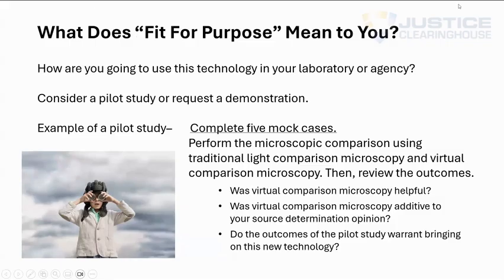So one of the things that I strongly suggest is doing a pilot study, figuring out what fit for purpose means to you. One example of a type of pilot study is to have, say, 5 mock cases, complete them with the light microscope, traditionally like you have done in the past, and then also using a VCM technology and comparing those two, or looking at that VCM and asking, was it helpful?